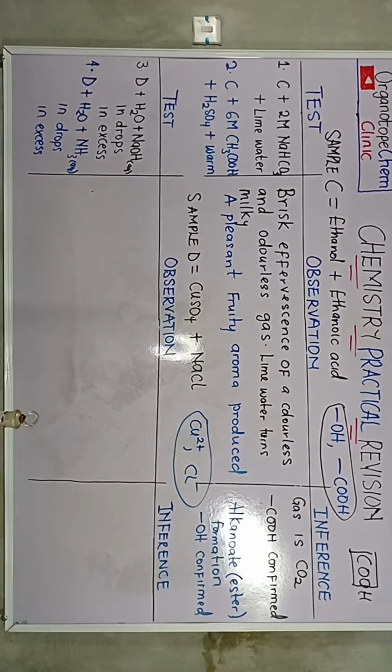Now, you are an A-level student, okay? You are not expected to write "suspected" under inference. It is not permitted. It is not allowed. Do not write something suspected, okay? Penalty noted, so that we can move on.